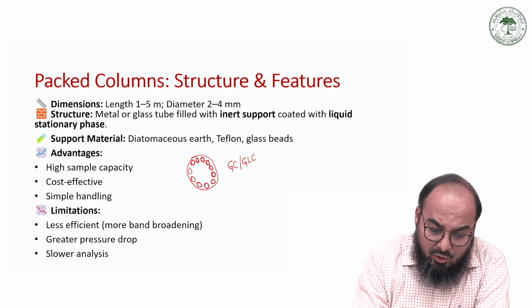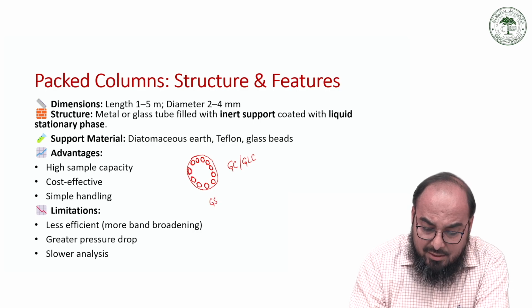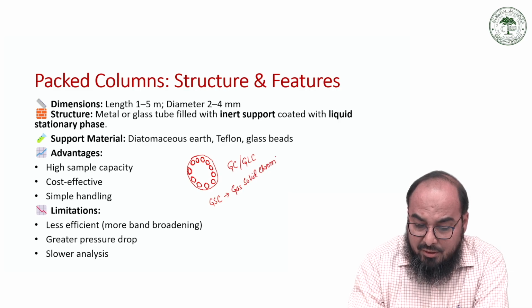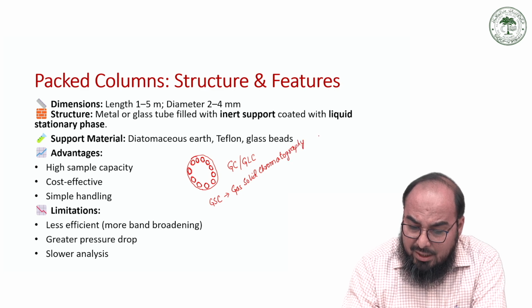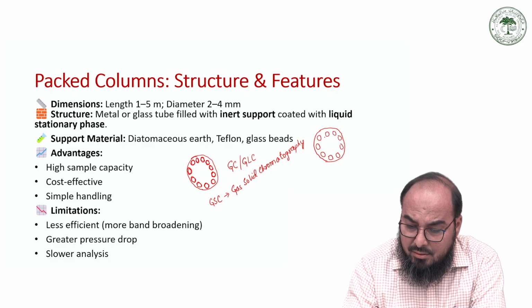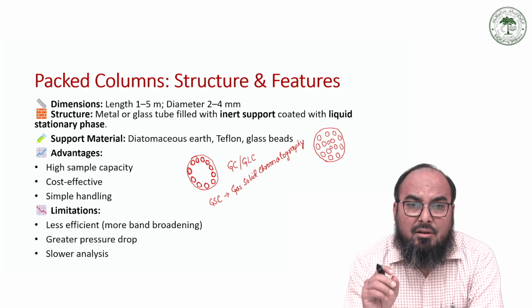Similarly, if you have GSC, that is gas-solid chromatography, then in the cross-sectional view you will get something like this. Here the stationary particles are not covered, but the adsorption occurs.